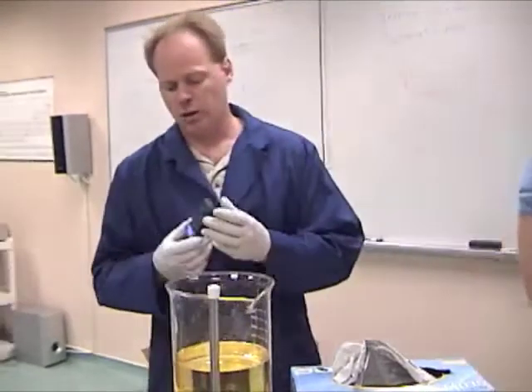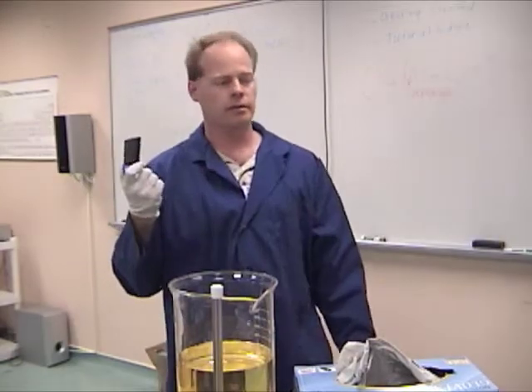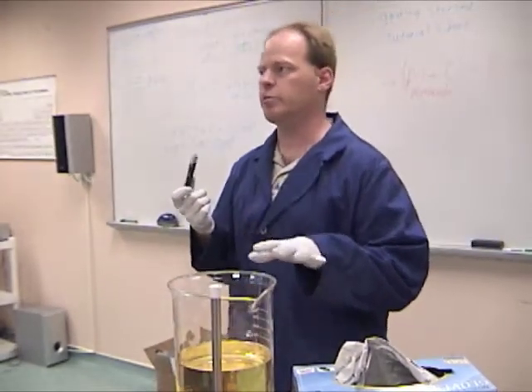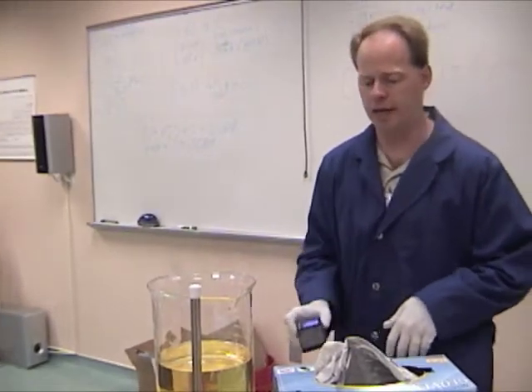Appreciate that. We're going to use just a basic scale. This scale is measurable down to 0.01. For biodiesel, for what I'm doing for this basic batch, I don't need to be that accurate, but when we use it for a titration kit, you do, okay?